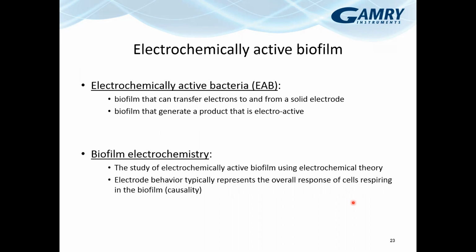And that means that the electrode behavior, the current or the voltage that you're measuring, represents the overall response of cells respiring in the biofilm, right? If it's not, then you're going to have a lot of difficulty, or it might be impossible, to even get at the electron transfer in biofilm.